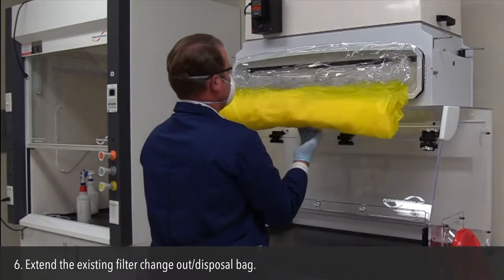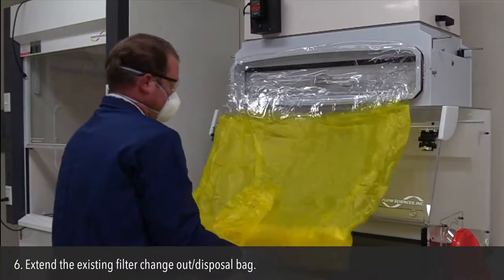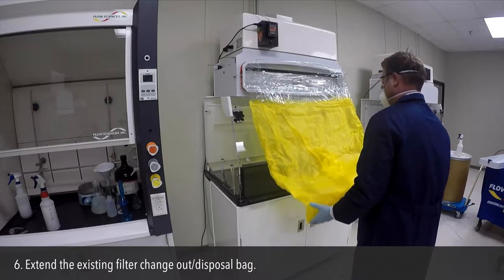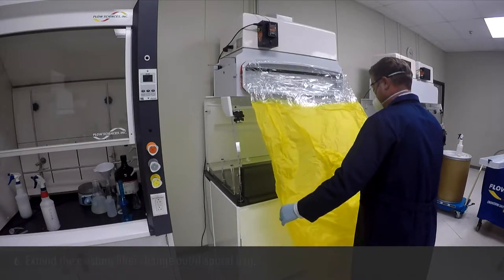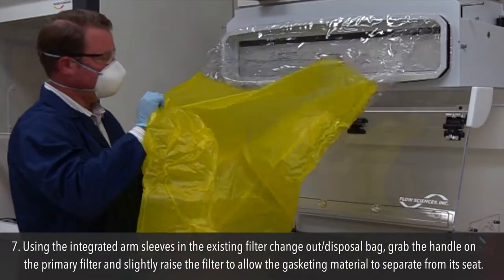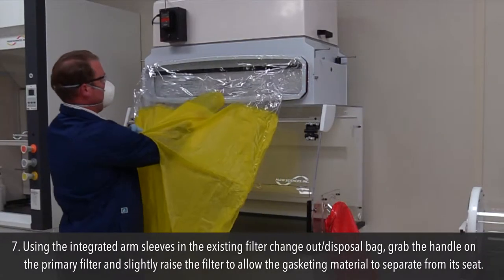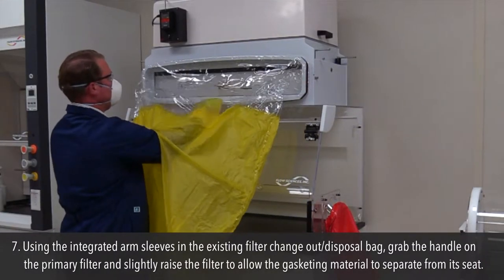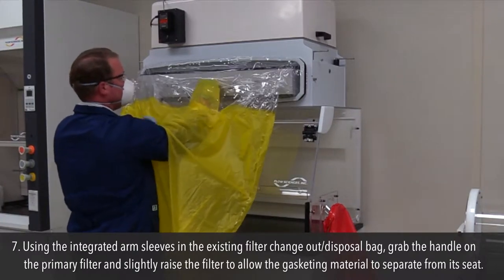Step 6: Extend the existing filter change out disposal bag. Step 7: Using the integrated arm sleeves in the existing filter change out disposal bag, grab the handle on the primary filter and slightly raise the filter to allow the gasketing material to separate from its seat.